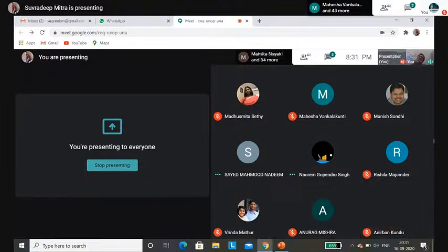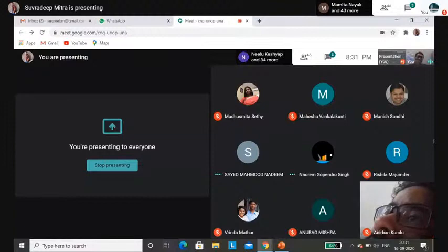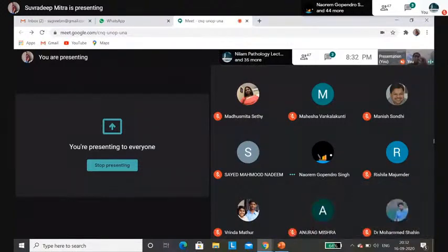So, sir, there is nothing called the best stain, but I feel that PAS and Masson trichrome are very helpful other than HE. HE can give you the idea, but PAS and Masson trichrome are very good stains. In addition, if you have the provision of silver stain, it can give you a nice outline of the glomerular basement membrane, and sometimes you can see nice rupture of the glomerular basement membrane for demonstration of the crescent, which is really, really helpful. I think there is nothing best, but you have to look into all kinds of stains. Silver stain is better. Silver stain can bring out.